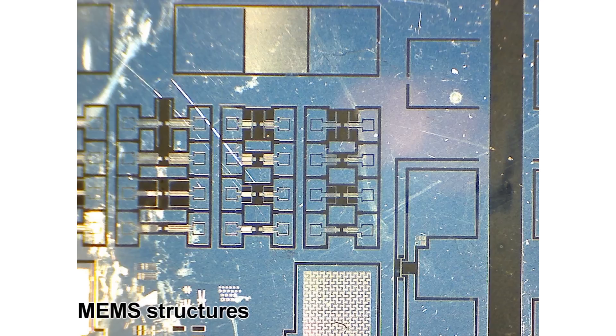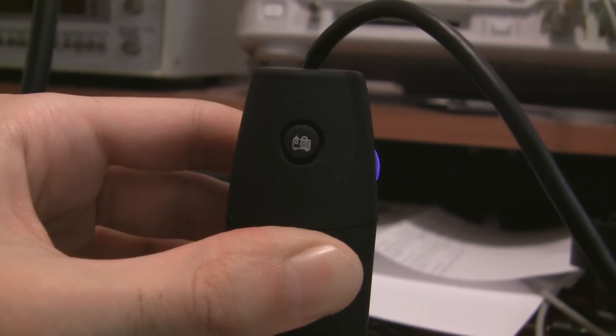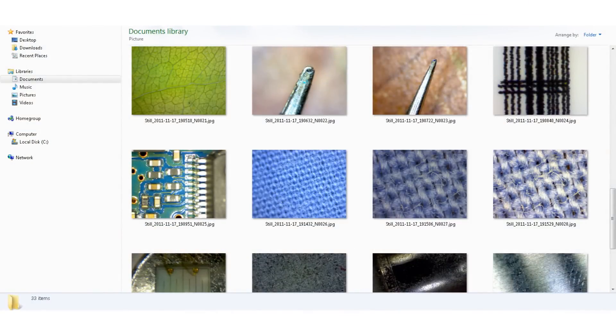So basically it's a surprisingly good microscope for 60 bucks. But it's not perfect, and here are my criticisms. After you click the capture button, it often takes a couple of seconds before the image gets saved, because the software is trying to wait for a non-blurry moment — but sometimes it just takes too long. Also there's no way to change the default directory where the files are saved; they end up in My Documents.